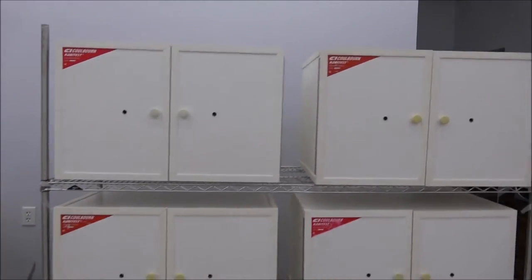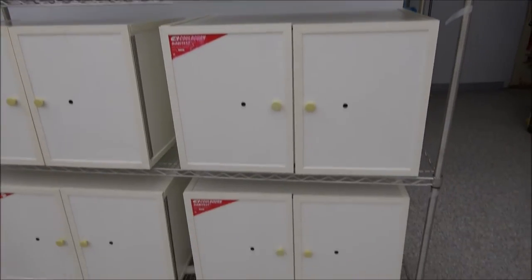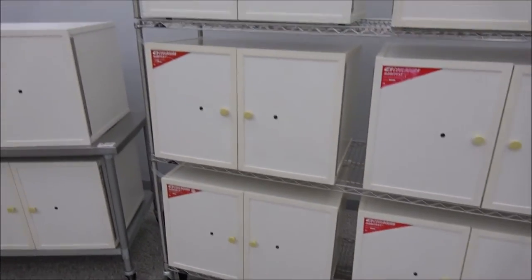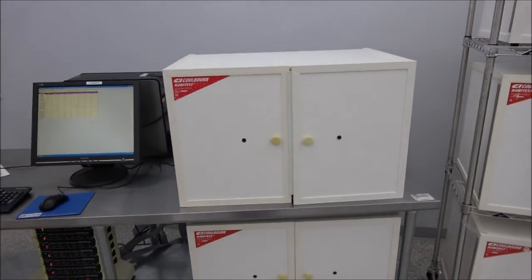So take another look at the outside of these cabinets. This will show you how nice they really are. If you are interested in this system or any other system, we do have three or four Colburn systems available.